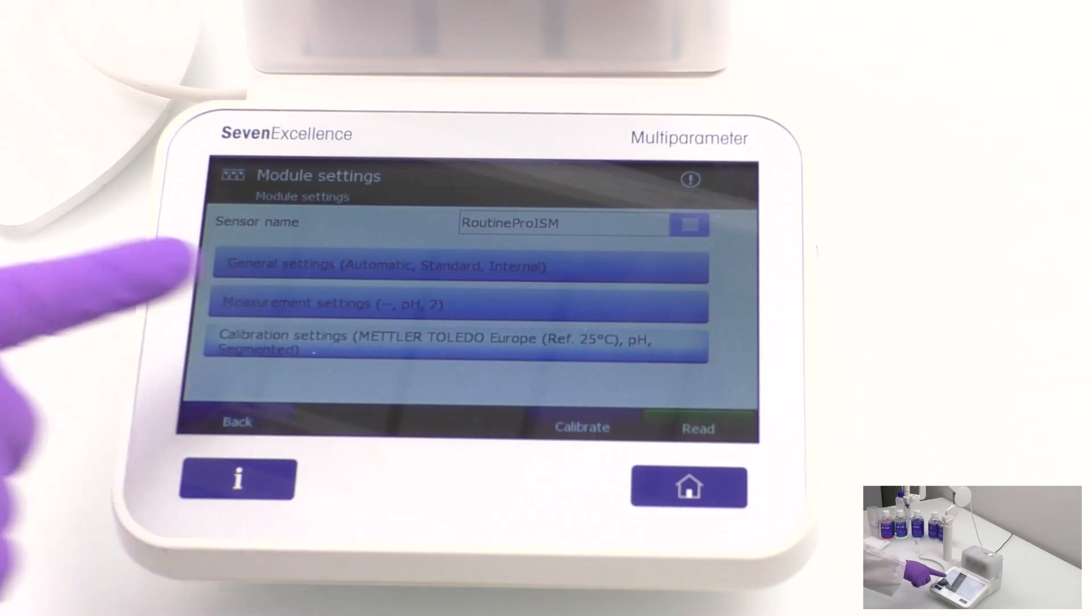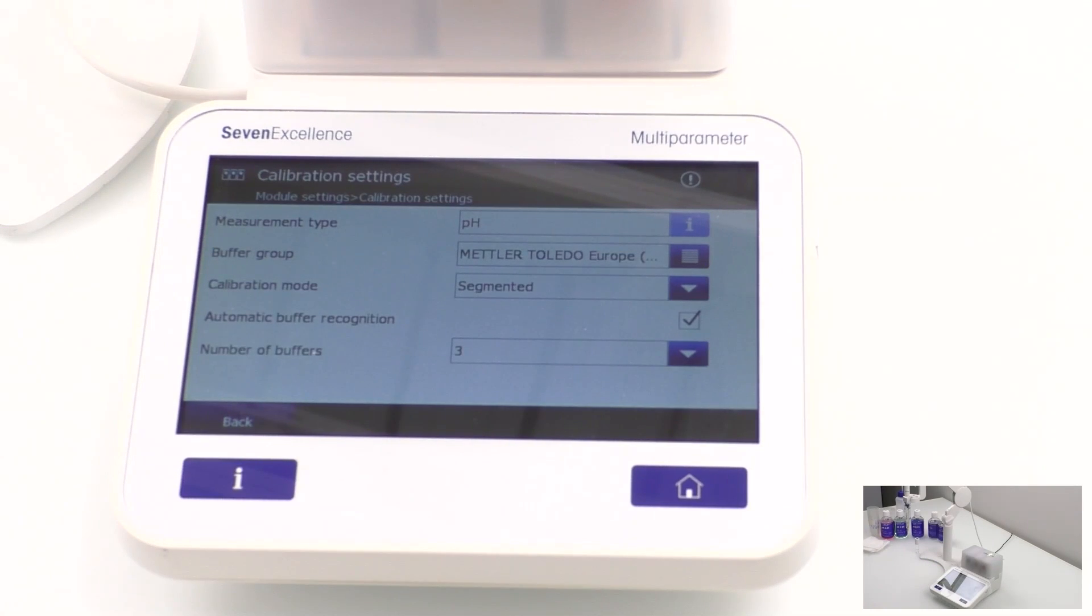For calibration settings, keep the default European buffer group, select the calibration mode Segmented, and select the number of buffers used. Once you've made your selections, select back.